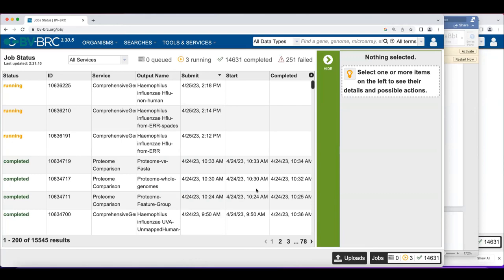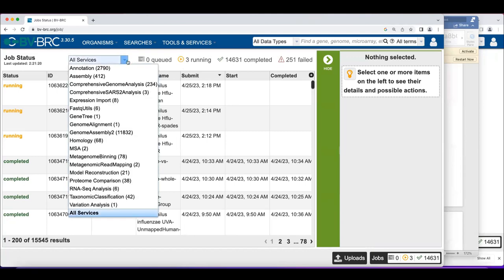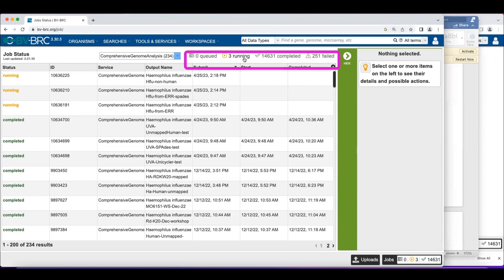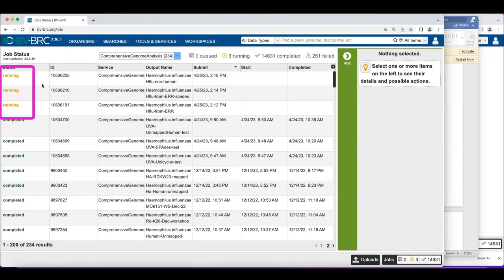After launching jobs, they appear on the jobs page. You can sort by service — for example, filter to show only comprehensive genome analysis jobs. The queue uses a fair-share distribution and understands how big jobs are, so if you push 10,000 or 20,000 jobs at once your priority goes down. 'Running' means the system has received the job — it may or may not yet have been pushed out to a node.